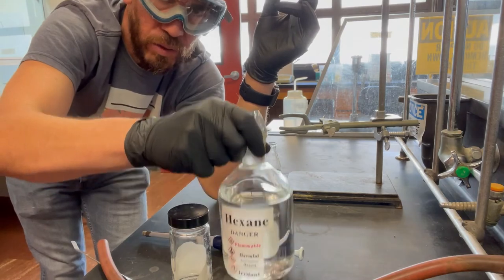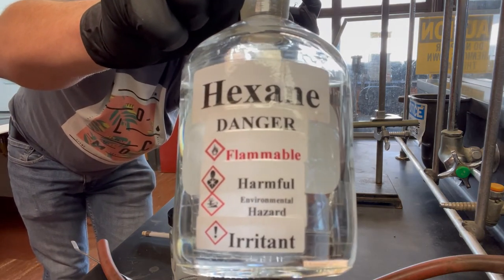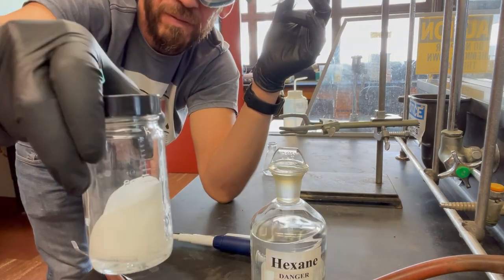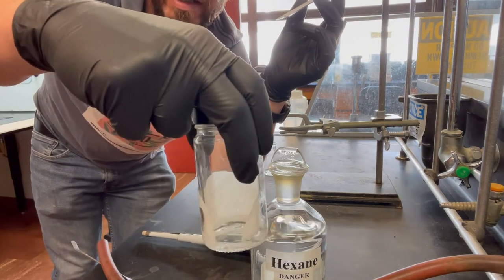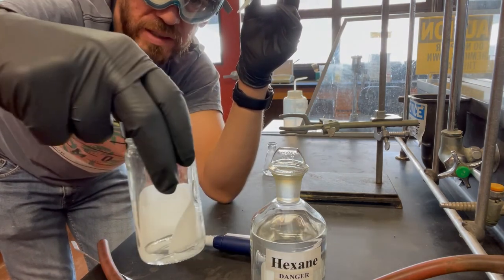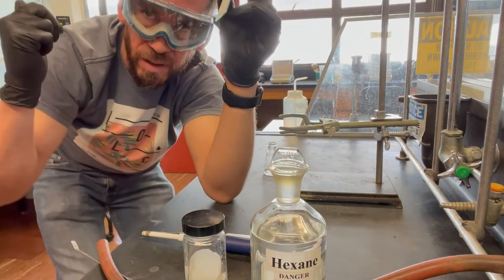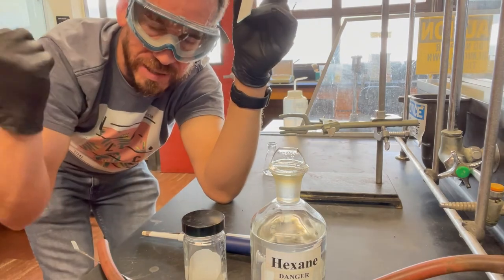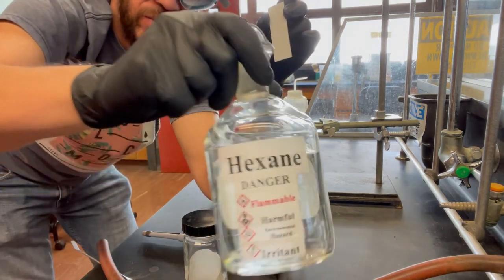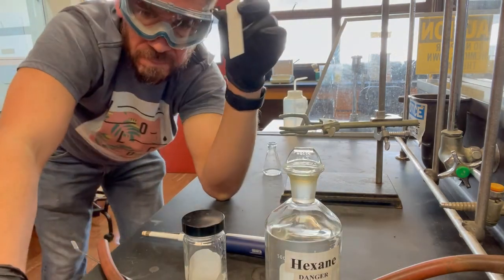I did want to show you. So we're using hexane as our eluent, right? Harmful, blah, blah, blah. I already prepared the chamber. You've seen this chamber before. It's got some filter paper in there, increased surface area for the hexane eluent. And I already put that hexane in there. It is capped right now. I prepared that inside of the hood, okay? Because look at all those harmful things. I like my lungs.